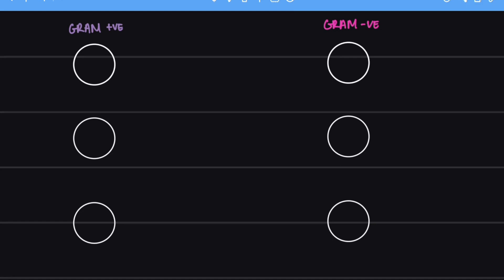Hello everybody, in this video we are going to understand the gram staining. So on the left side I will be indicating the gram positive bacteria and on the right side we will have the gram negative bacteria. So let's start with the procedure.